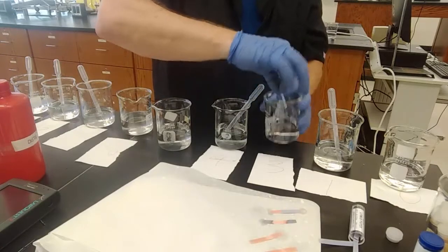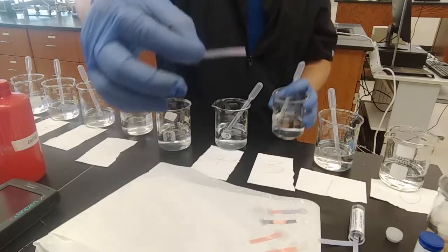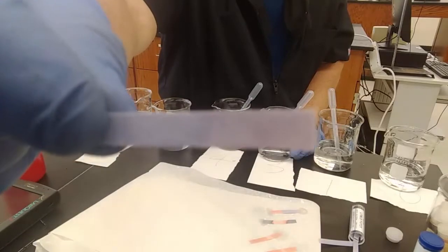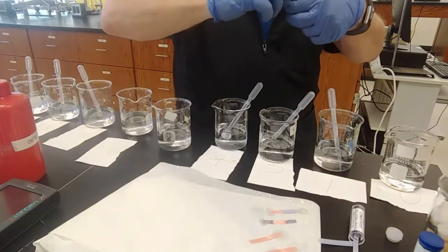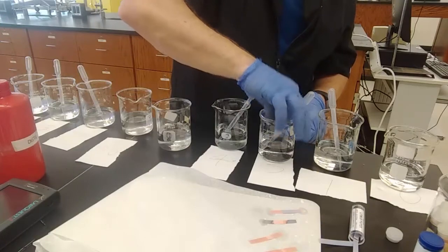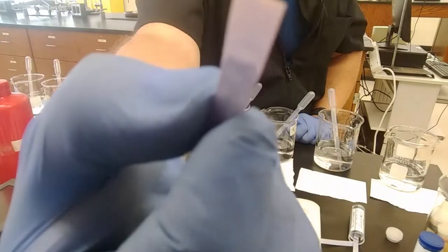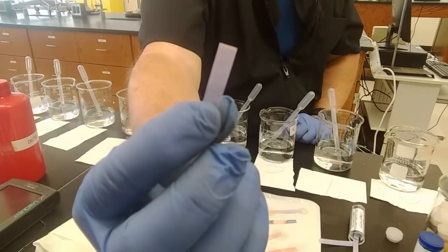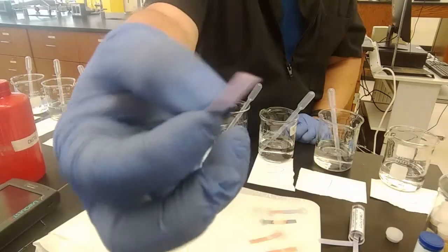3, expected. This litmus paper might be old. Give it a minute. I don't know if the camera is going to pick it up. There is a bit of red at the edges. Try the other end. No, this one is acidic. There, this end is a little bit better. Definite red on the end, if the camera will pick it up. But certainly not as dramatic as for 1.